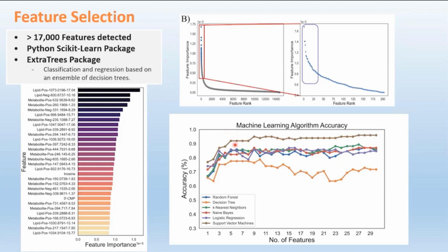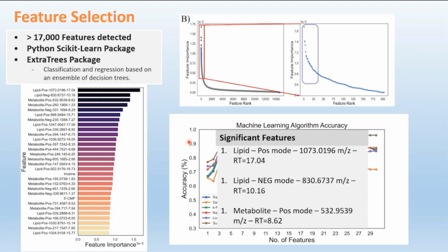And we thought right here around 90% accurate was a good place to go. And that includes about 5 unknown metabolites within that list that we could spend our time on. And note that support vector machine learning was the most precise model in building this. And so this is a list of those metabolites.